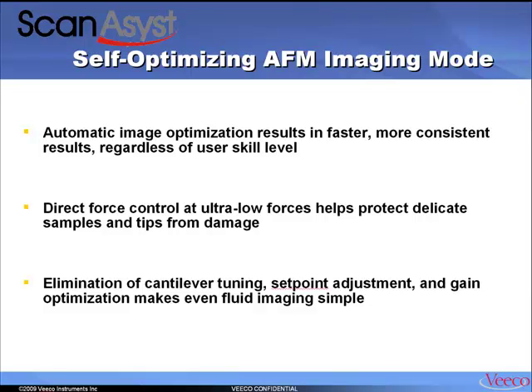And being a sub-resonant technique, cantilever tuning is completely eliminated, and that of course makes it much easier to scan, and it is even applicable to imaging in fluids. There's basically no difference from a user perspective between imaging in air and in fluids.